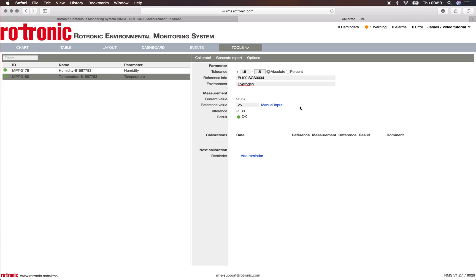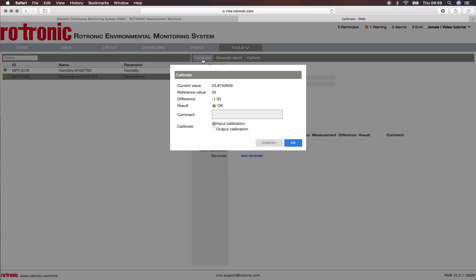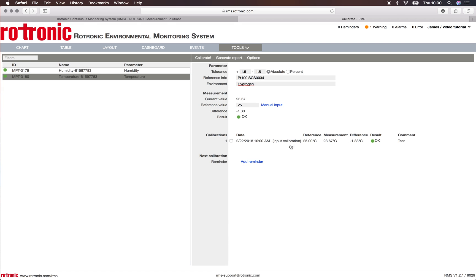What we can then do is simply calibrate. The system will ask us if it's an input calibration or an output calibration, and we can add comments. Here's a comment: we can do a test calibration. This is an input calibration. You then click on OK, and we see here directly that we've done an input calibration of the device and the results are OK.